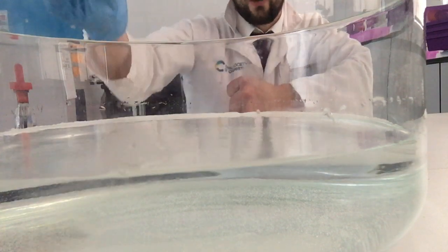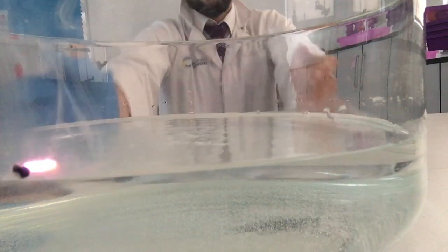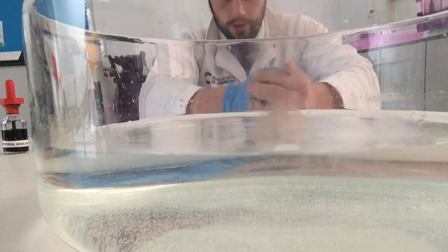Okay, I'm going to put my last one in. This is potassium, which we looked at briefly last lesson. Woo! And that was it. That was a very quick reaction of potassium. Again, it's producing hydrogen gas and potassium hydroxide.